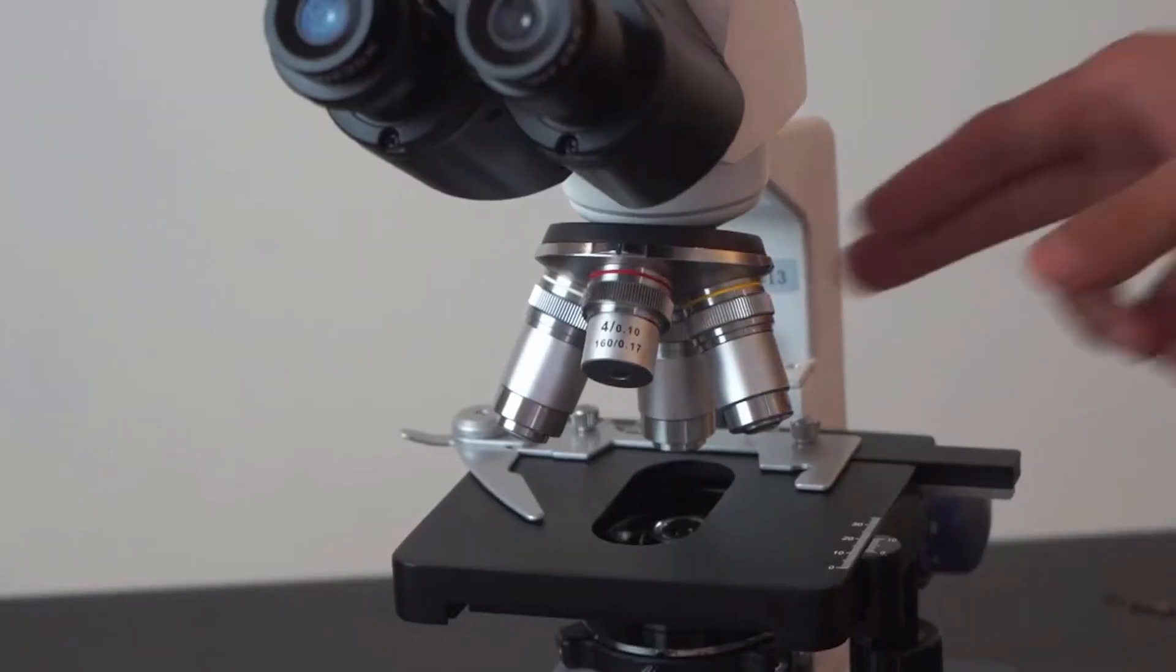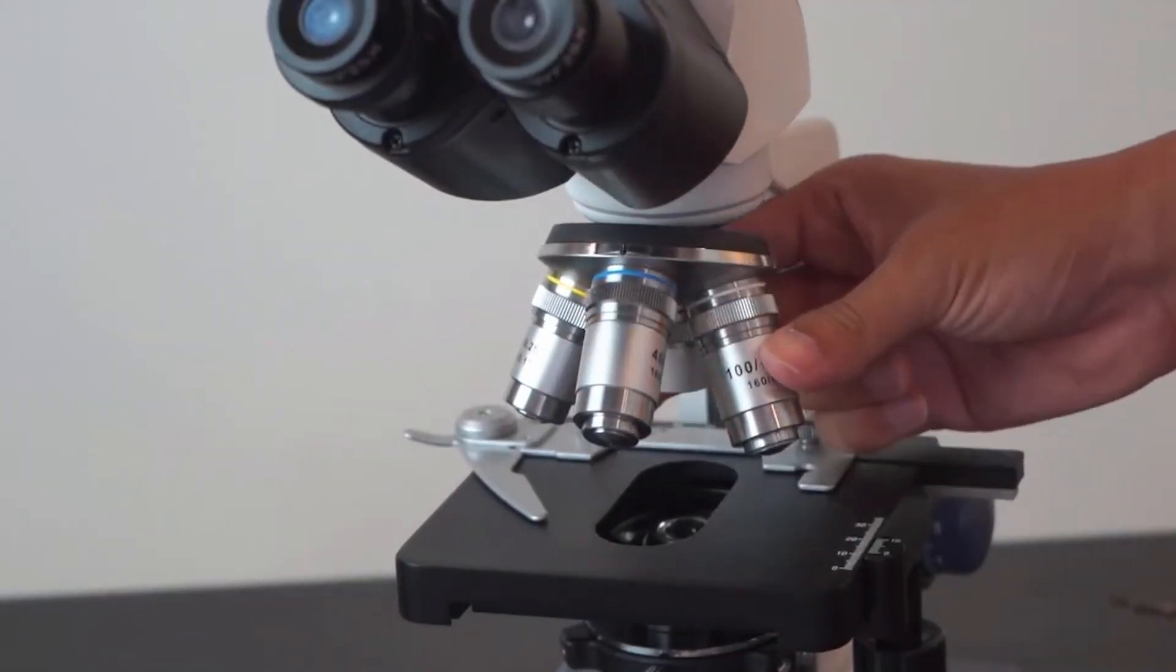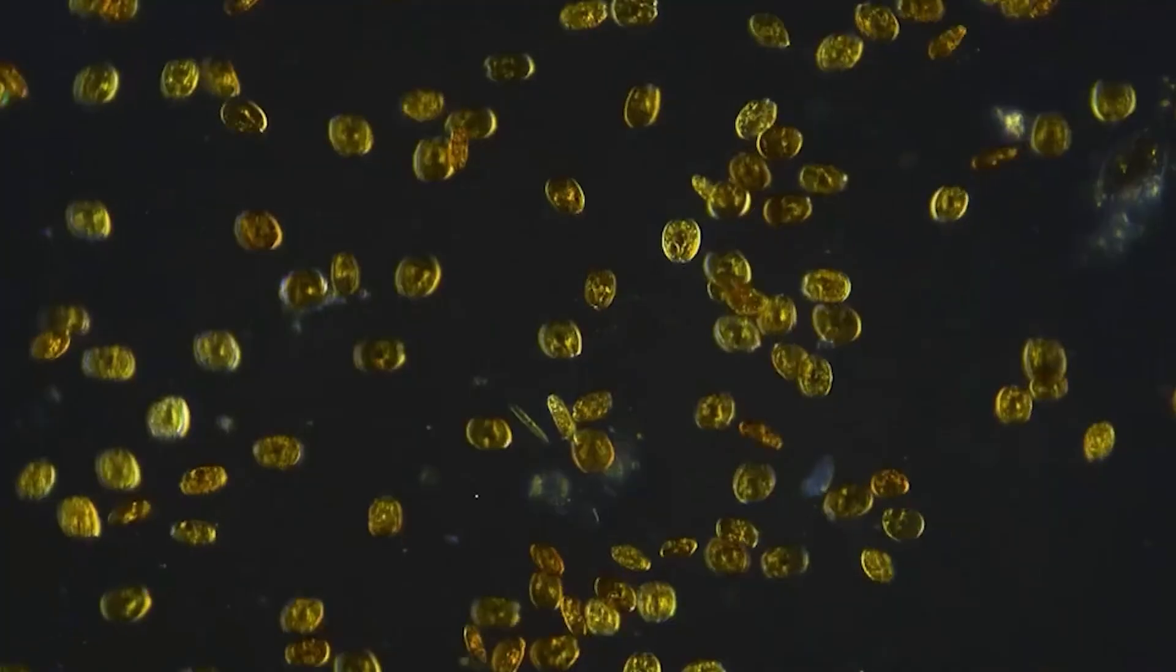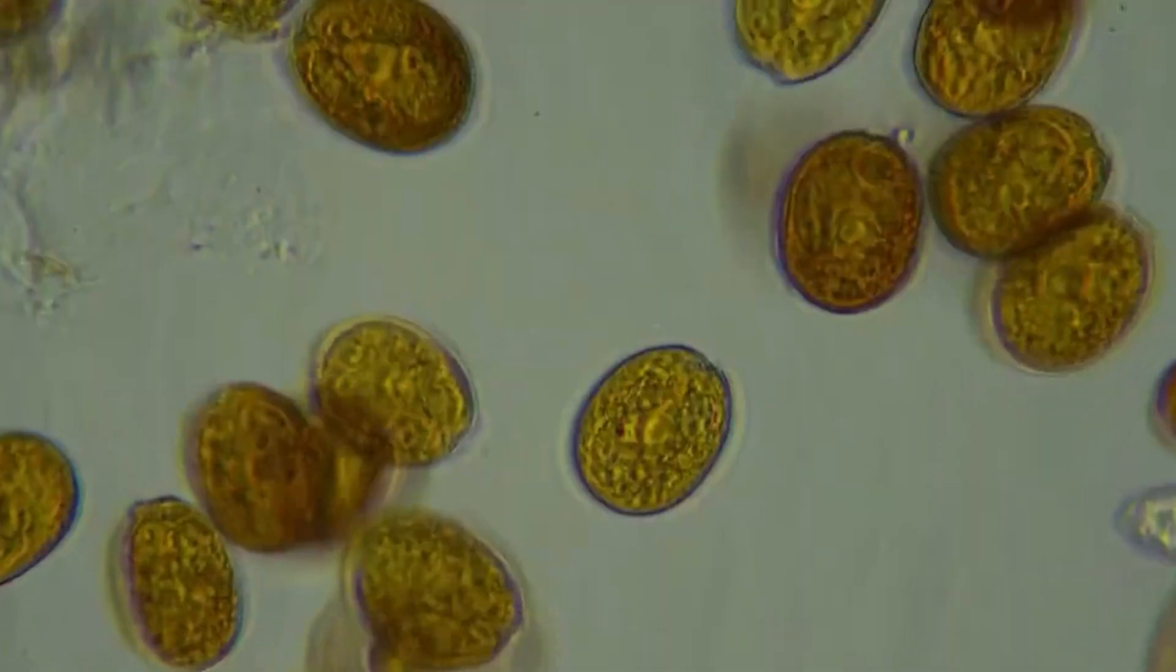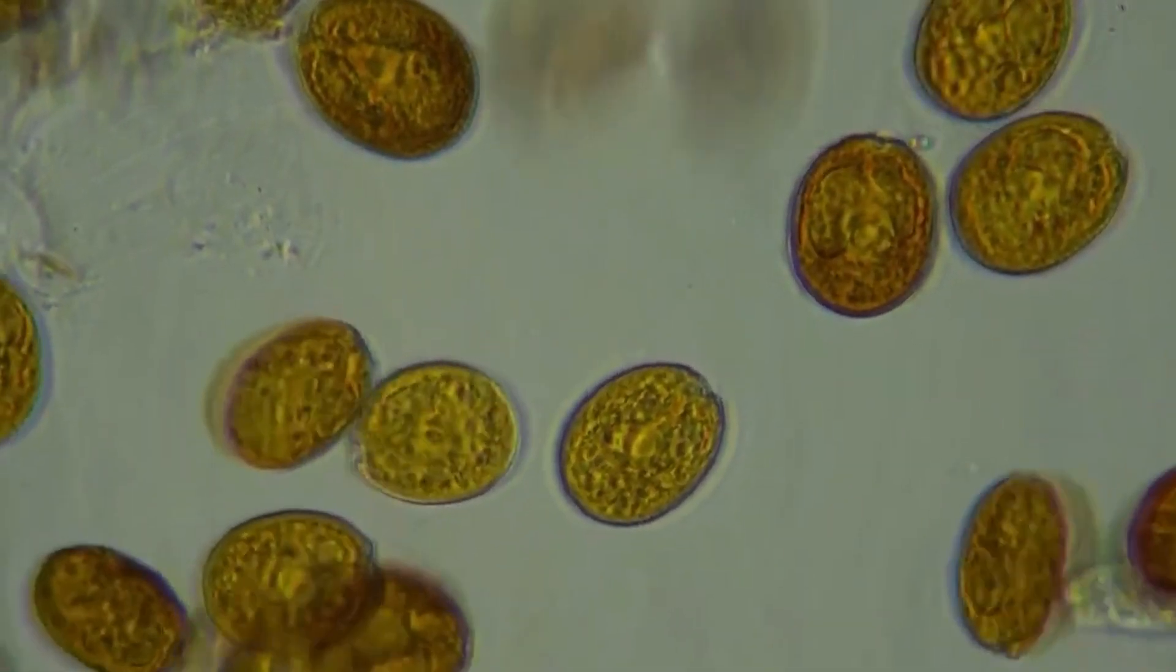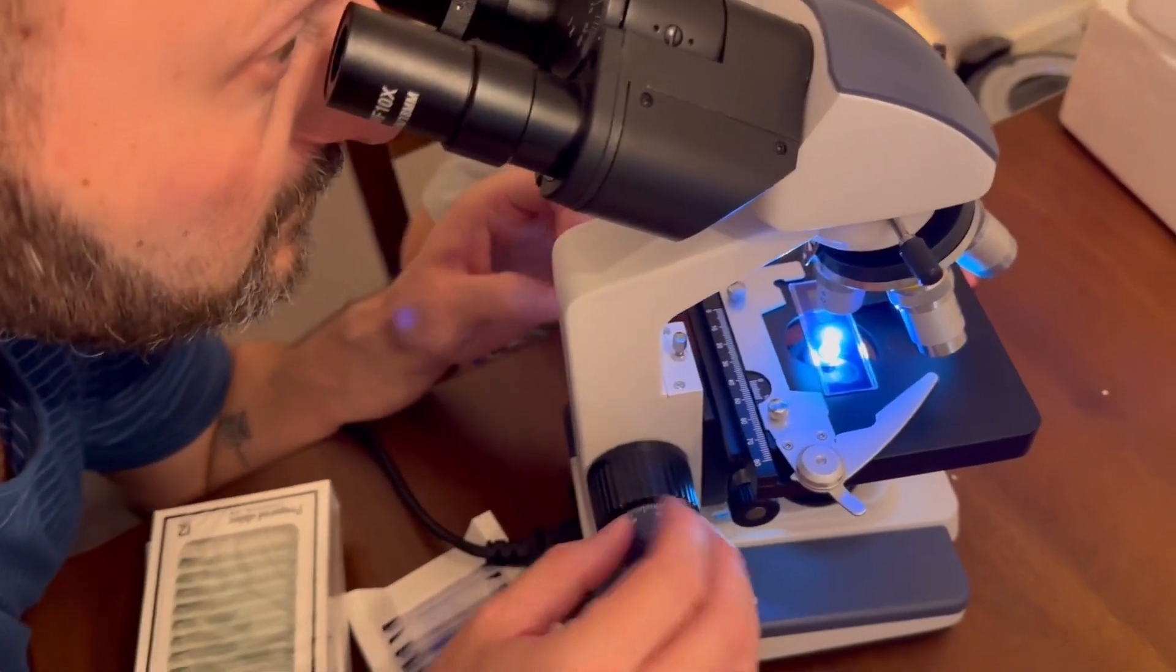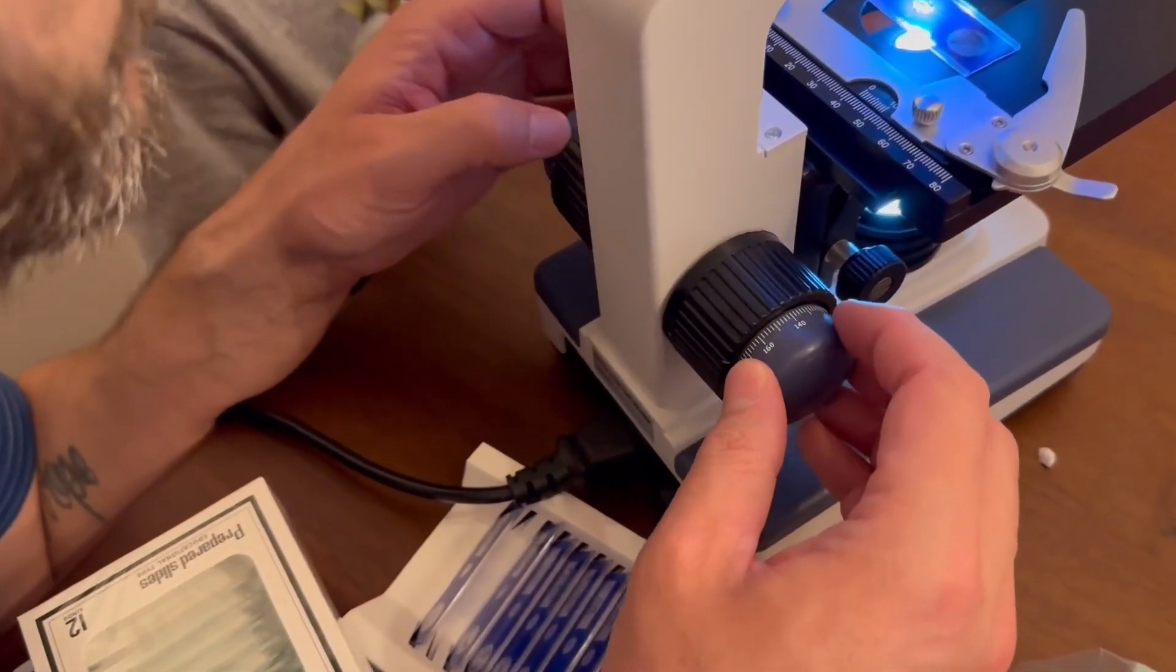The professional 30-degree inclined and 360-degree swiveling Seidentoff binocular head enhances comfort and versatility. Additionally, the large 3-dimensional double-layer mechanical stage includes coaxial coarse and fine focusing mechanisms for added precision. The high-quality Abbe condenser, complete with an iris diaphragm and filter, further enhances your viewing experience.